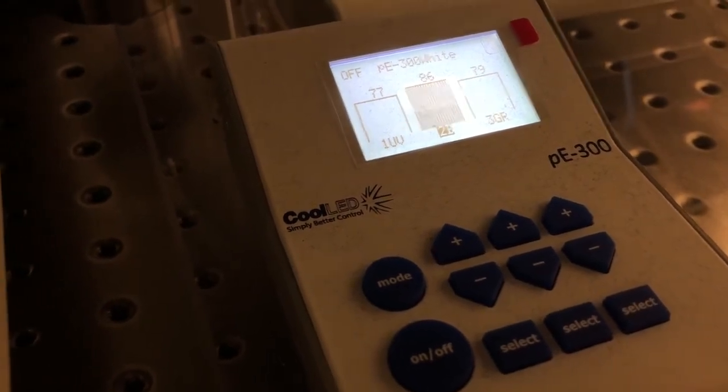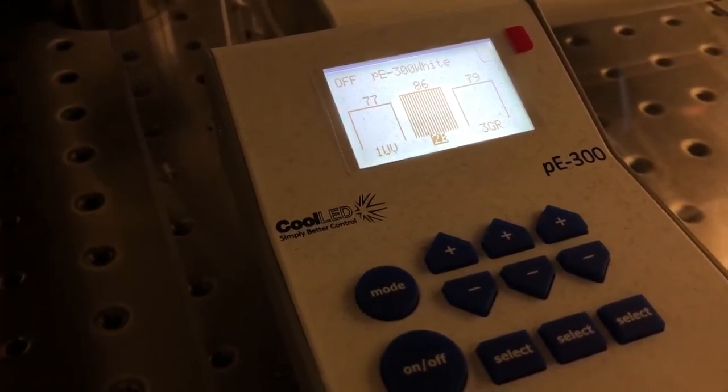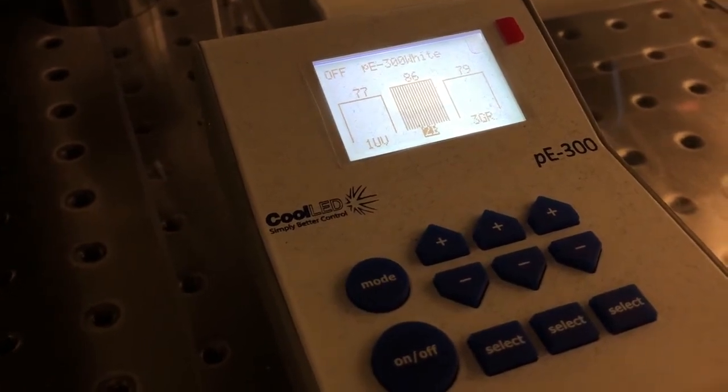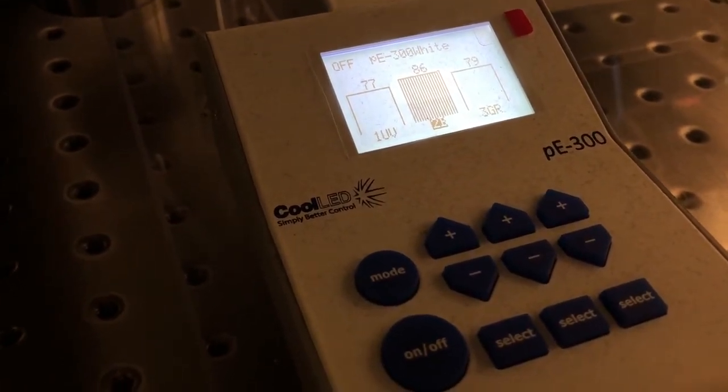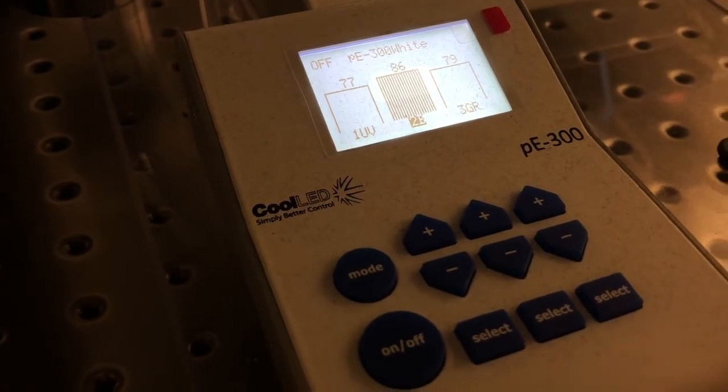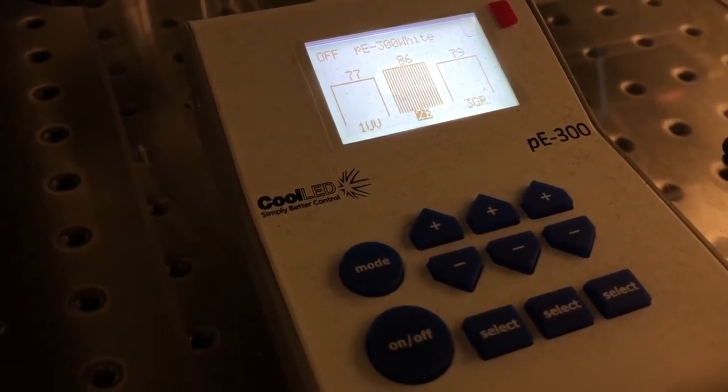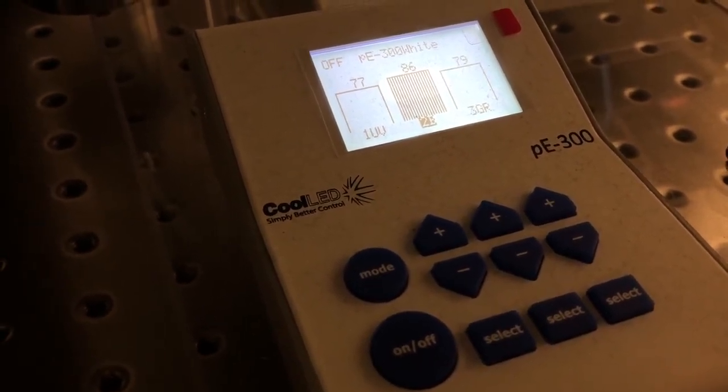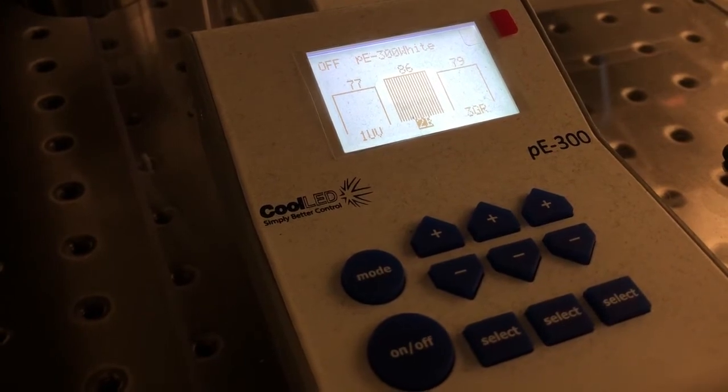Usually this doesn't matter because we have a filter cube on the instrument that will do the filtering, but if you want to be absolutely sure that there's not even a little bit of light leaking through, particularly from the UV, you can go ahead and turn off those alternative LEDs that you're not using.